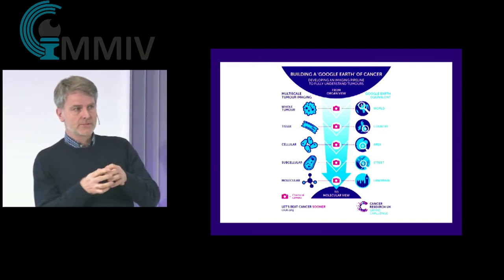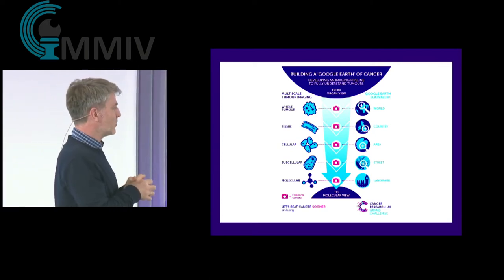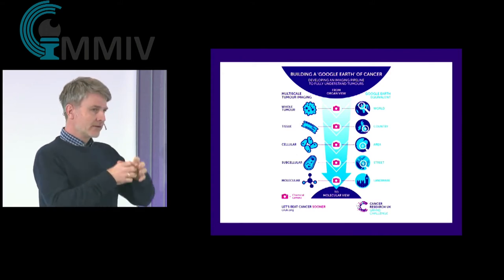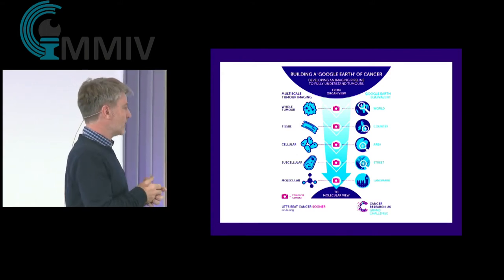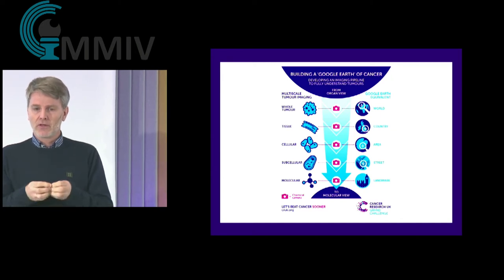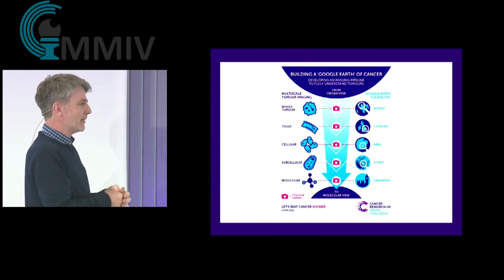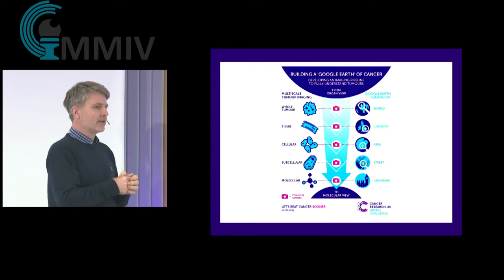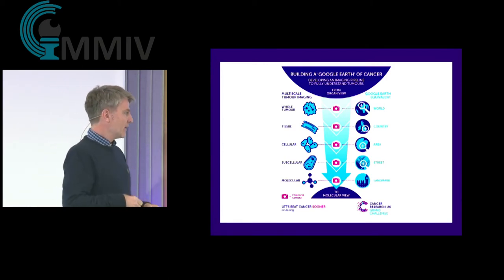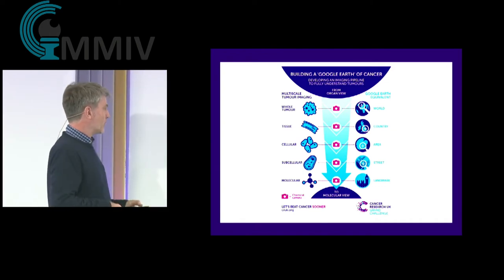But also, with this project, I think we, with this imaging mass cytometer, can also help in giving more information about tumors. Because many technologies up until today have looked at the tumor, and it's growing, and finding the tumor, identifying it in the body, but we have to go further in. We have to zoom in like you do on Google Earth. You look at the world, the country, the area, you find the city, you zoom into a part of the city, and you find the different landmarks. And then you can see the different parts and how they are located in the tumor.